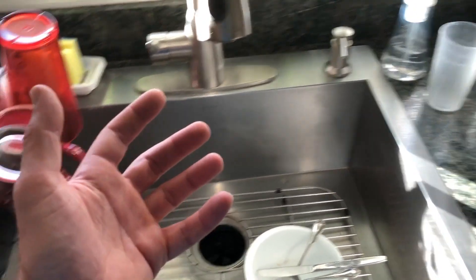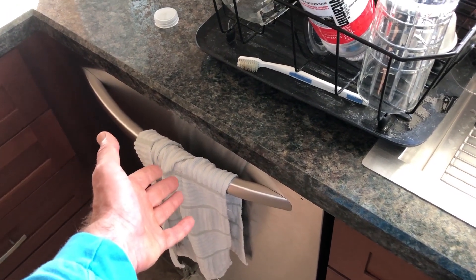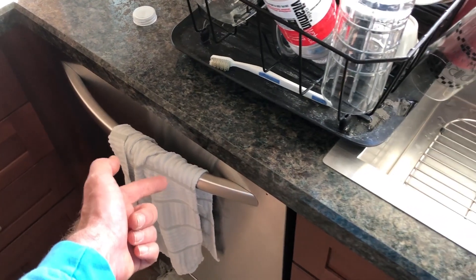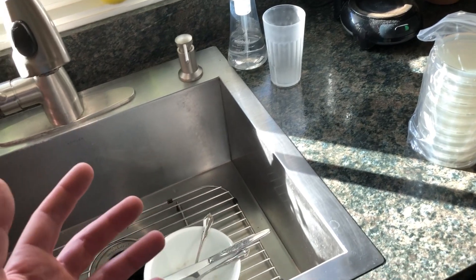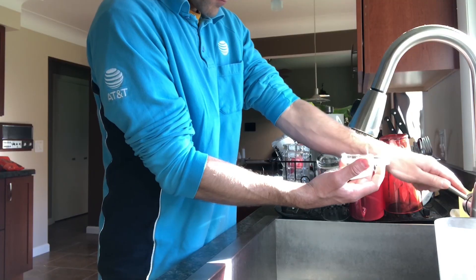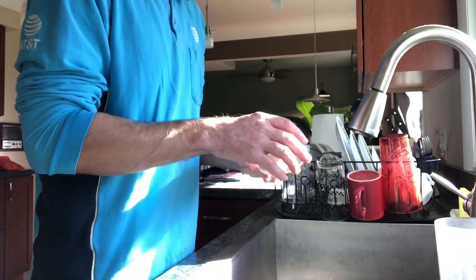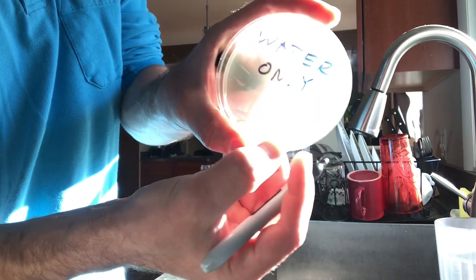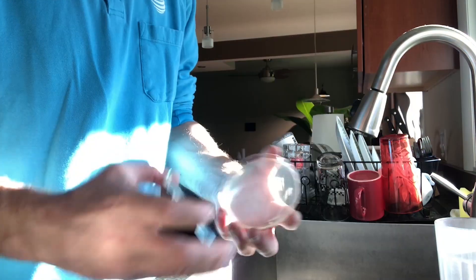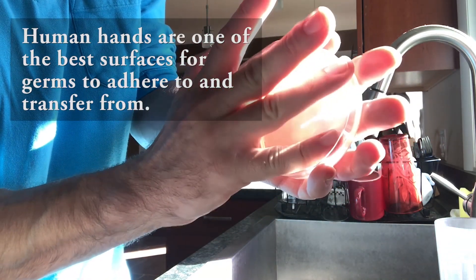Then I'm going to dry my hands with a regular hand towel that hasn't been washed — I'm not sure how long, but it's been there for more than a day and used a few times. I'll dry my hands on that towel and touch another plate, then dry my hands on a paper towel and touch another plate, to see if we pick up any bacteria from things that are supposed to be clean.